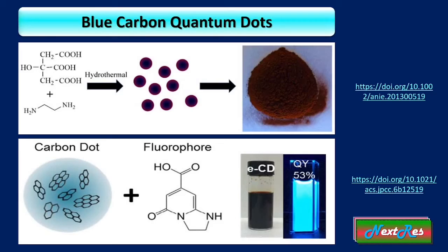Here in this slide you can see the structure of the fluorophore. It has been found that this fluorophore can highly modify the quantum yield of the quantum dots. And this structure has been confirmed from NMR studies.